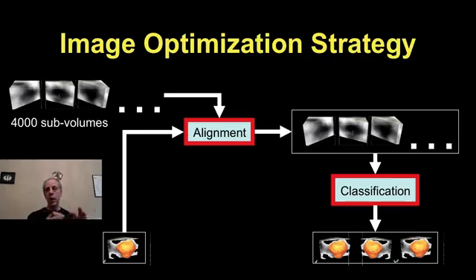So you say, okay, now I have them all aligned. I have them all in a common space. Now I want to group them to try to only put in the same group those envelopes that basically have the same three-dimensional shape. And there are many ways of doing this classification or clustering. But let me just illustrate one example. So you have all of them aligned, and now you have the distance that basically led you to the smallest alignment rotation. So you align them, you rotate them, you have the distance.